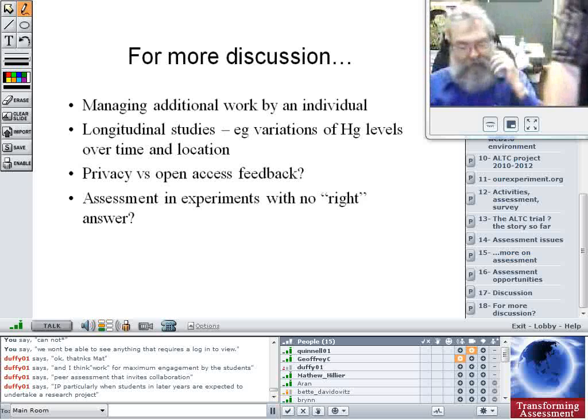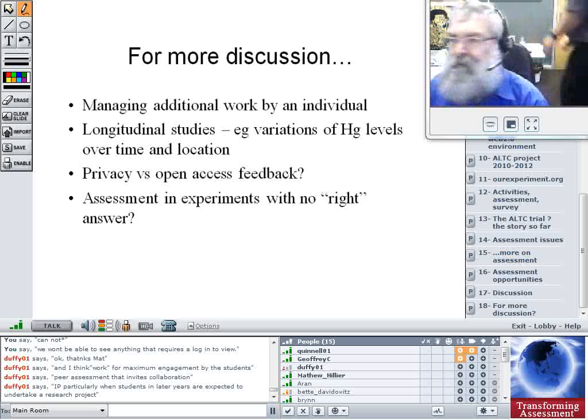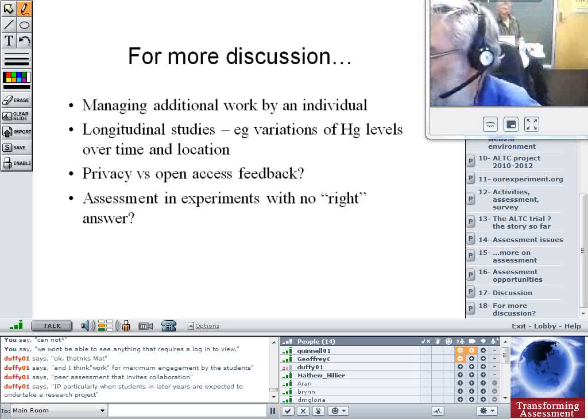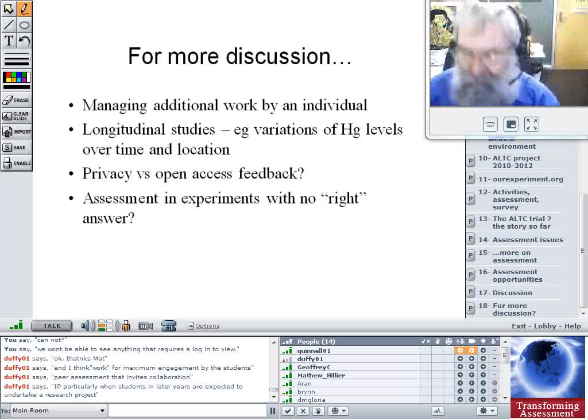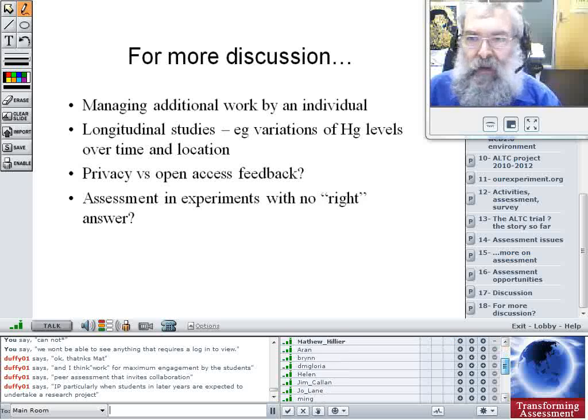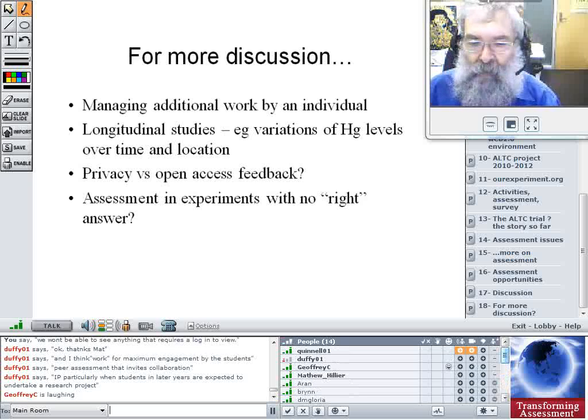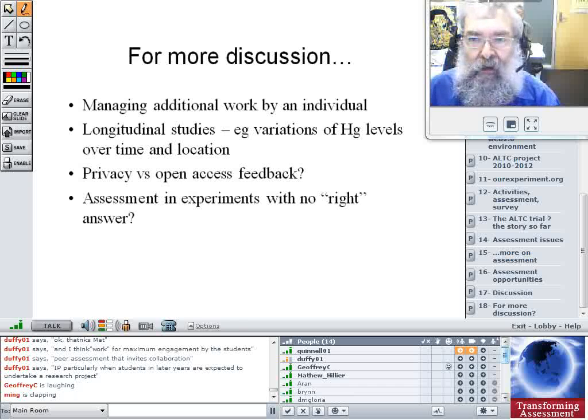So hello everybody, me again, or me first time. Thanks ever so much, Neil and Rosanne, for going through all of our stuff. Hope you've got some flavour for what we've done in this project. As I say, we've really built on the Southampton ELN, electronic notebook, and that was our sort of starting point. And we've managed to show, I think, quite nicely how it could be integrated into an undergraduate curriculum.